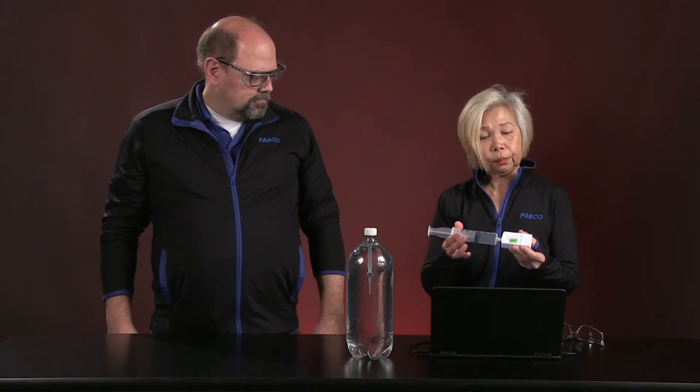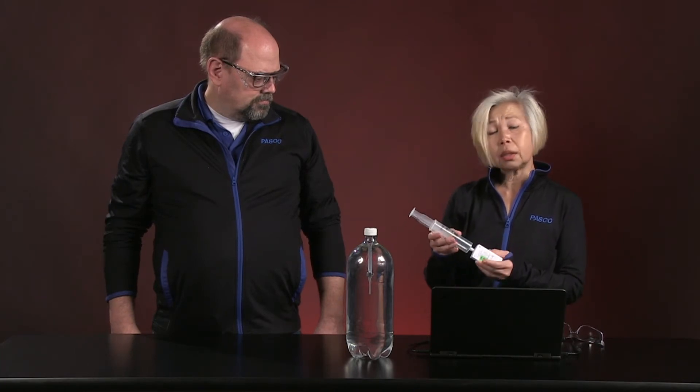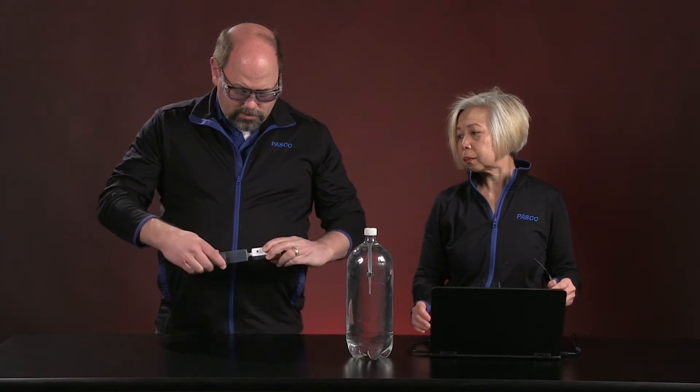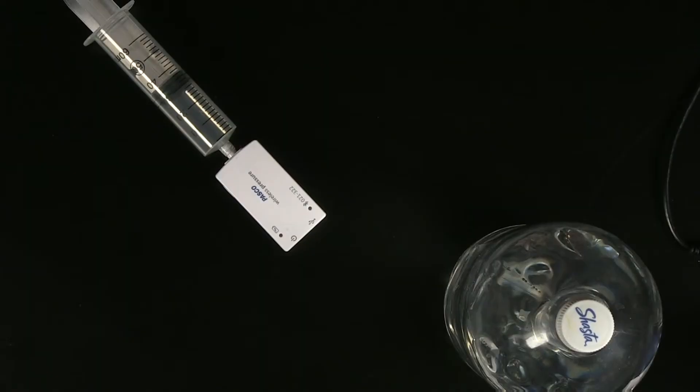We have a syringe and a wireless pressure sensor. Roger has filled the syringe with 30 milliliters of air. We are going to be running the experiment as indicated in your worksheet, beginning with 30 milliliters of air. Let me show you what happens when I change those volumes.